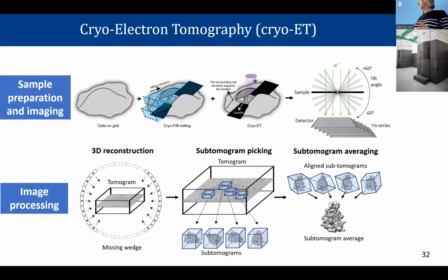This is called a tomogram. Then you extract these individual molecules into sub-volumes that are called subtomograms, and then you have a very similar procedure to single particle analysis to align those, to classify them, to get subtomogram averages. Those are the averages of aligned subtomograms. And also you can analyze conformational variability of these complexes, but this time in situ.